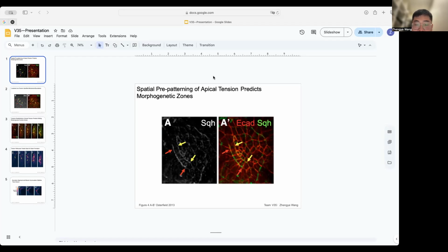To capture the spatial and temporal dynamics of these proteins, confocal microscopy was employed to image both the apical and basal surfaces of the epithelial primordium across developmental stages. These were reconstructed into top-down or oblique views to reveal the distribution of myosin and Bazooka during morphogenesis.